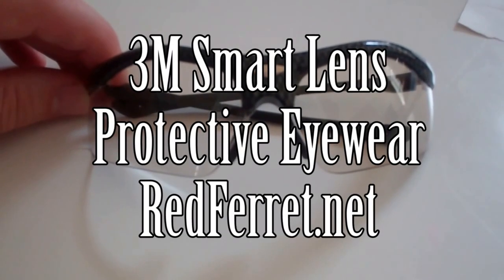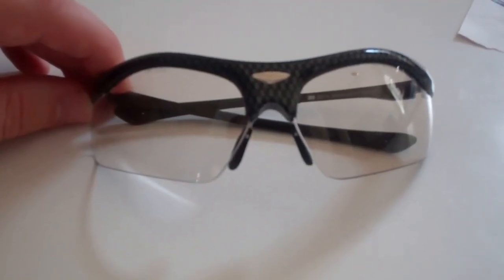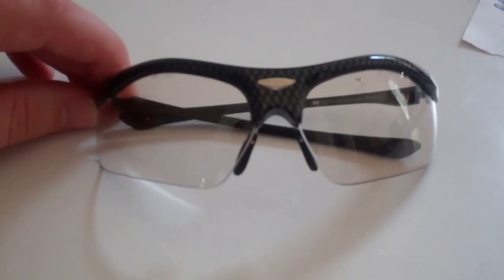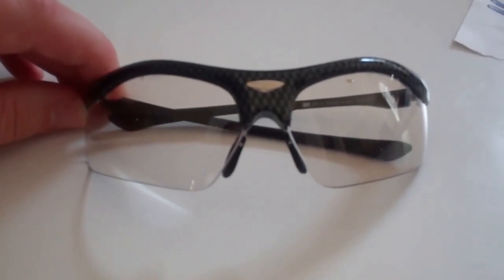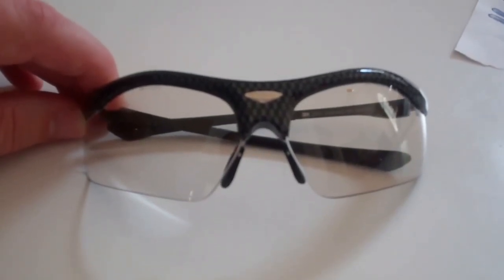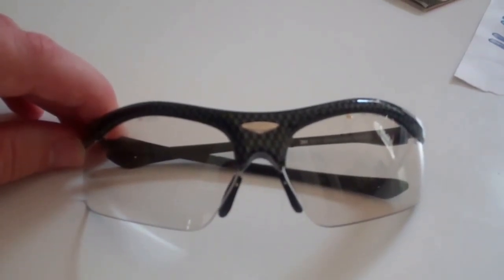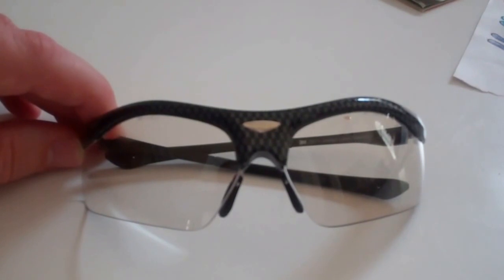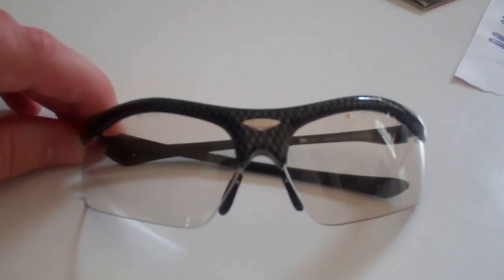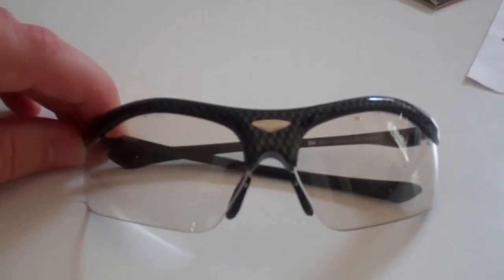Today we're going to talk about protective eyewear and the 3M Smart Lens. These are some lightweight photochromic safety glasses that in a pinch can actually work as pretty decent sunglasses. They're photochromic, meaning that they have dyes inside the lenses that are triggered by light that self-darken the glass — or actually, in this case, plastic. When the light source is removed, they go back to being completely transparent.